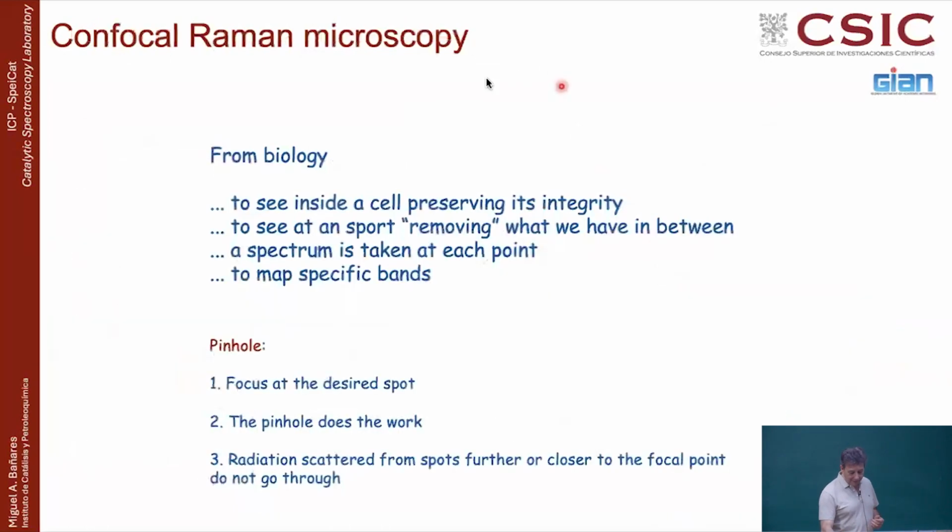Okay, confocal microscopy. How many people are acquainted with what a confocal microscopy study is? But you have the word confocal.